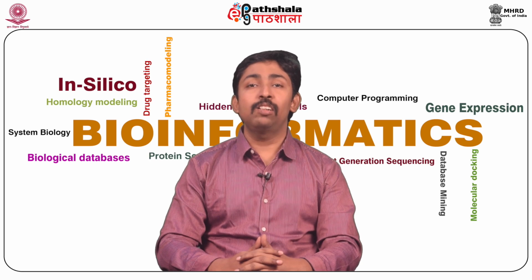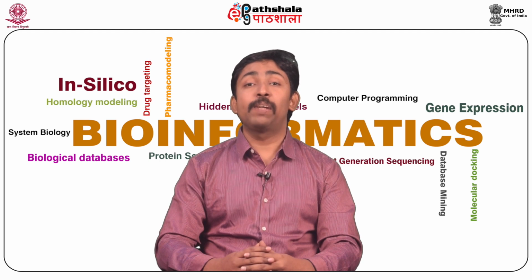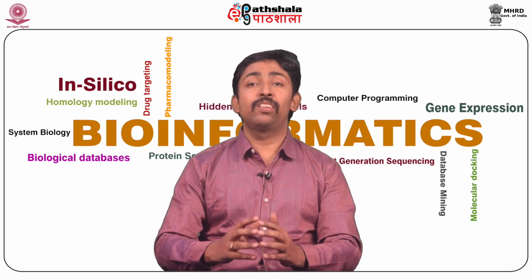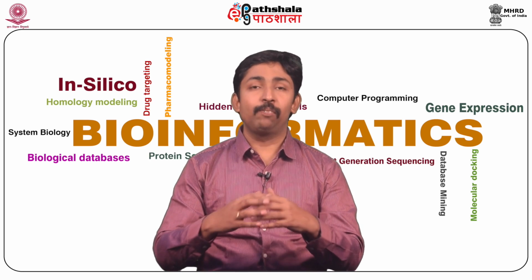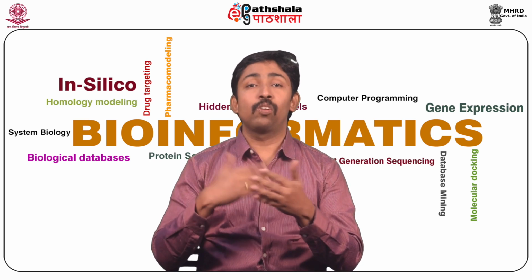The BioPython function Bio.SeqIO.parse with an empty bracket is used to read in sequence data as sequence record objects, and this function expects two arguments. The first argument is a handle, which is used to read the data from, or a file name. A handle is typically a file operand for reading, but could be the output from a command line program or data downloaded from the internet. So it could be anything.